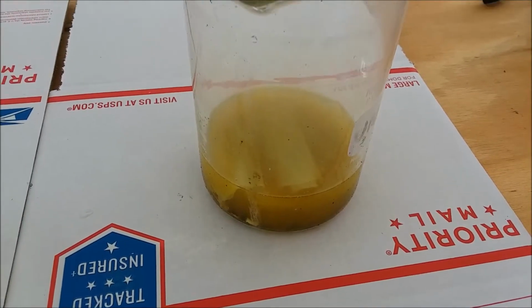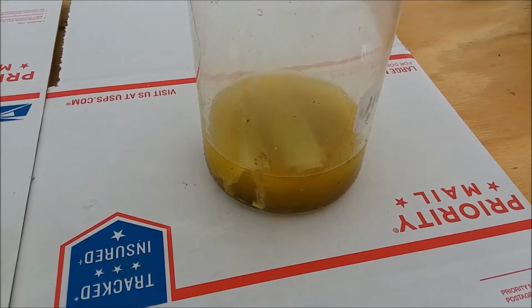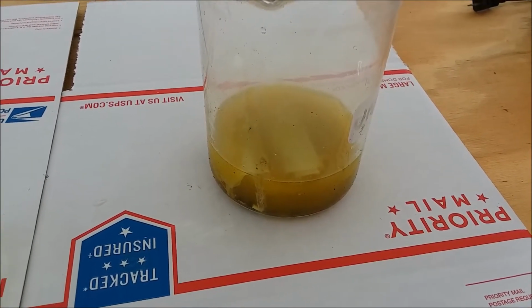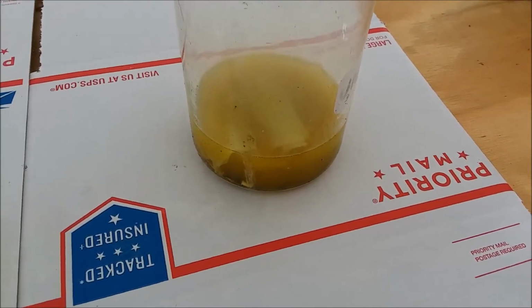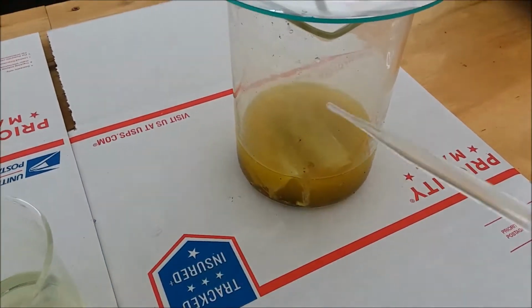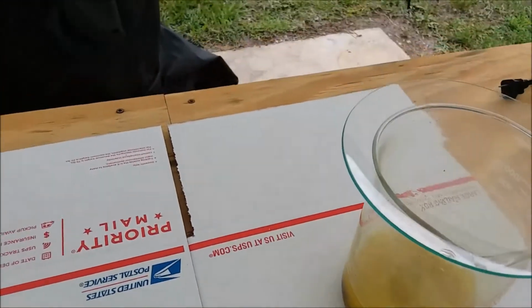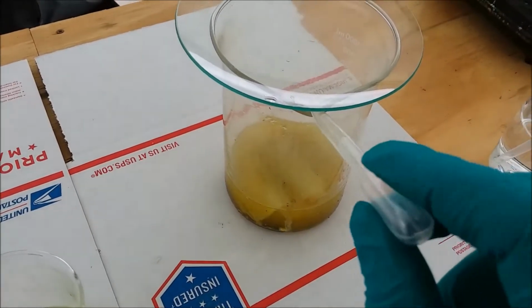Okay, the reaction seems to have pretty much ground to a halt. I would say 2/3 to 3/4 of the gold's probably in solution, but I went away for a while, did some stuff, came back, and it didn't look like much has changed. So I'm going to give it a couple more shots of bleach, and see if I can get this reaction going and get the rest of the gold into solution.